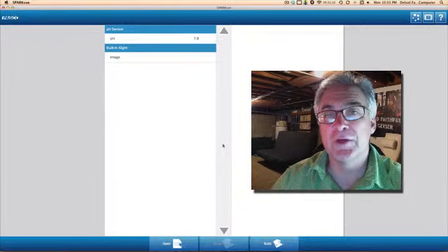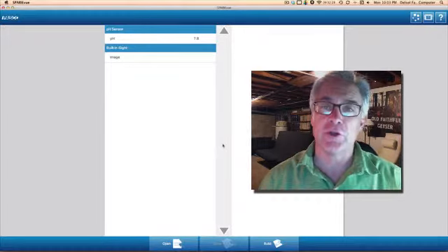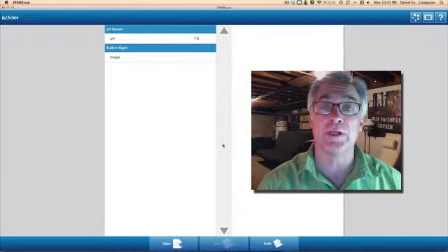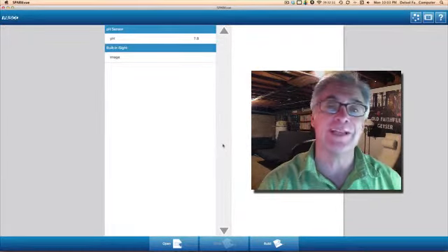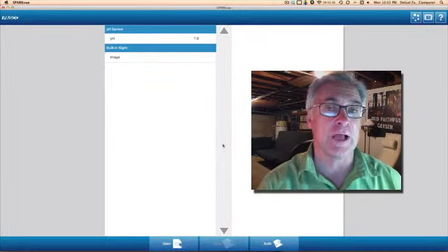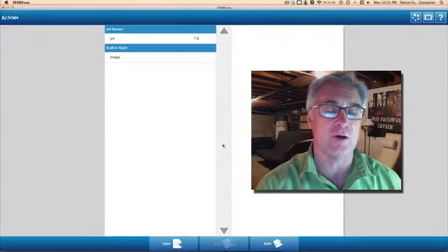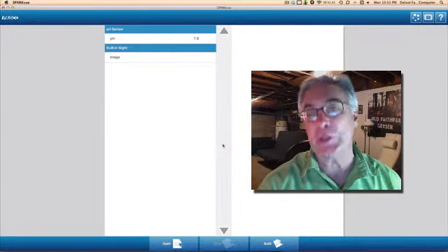The purpose of this video is to show you how to set up the lab for the role of buffers. What I'm trying to do here is just show you how the software works in Spark View on our Spark data loggers as well as our Spark links. You have a choice or an option of using either the handheld devices or you can use the ones that are hooked up directly to your computer. Kind of up to you.